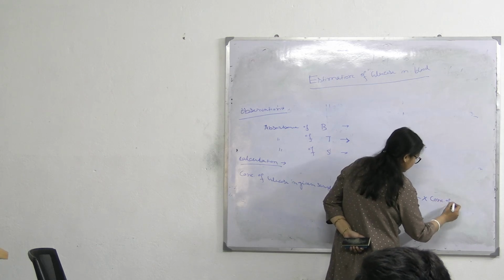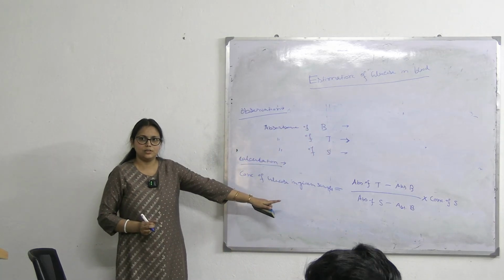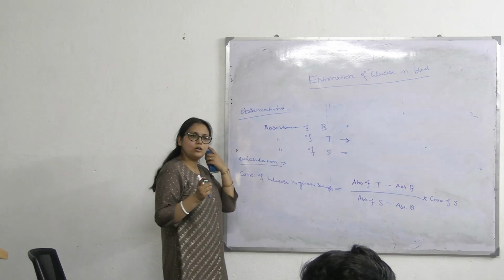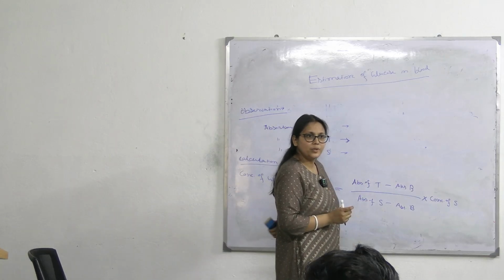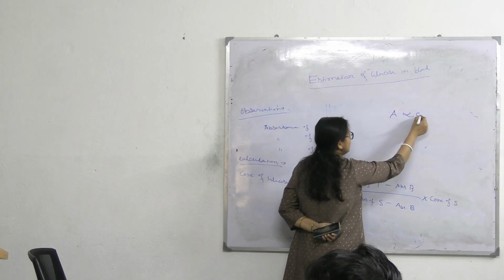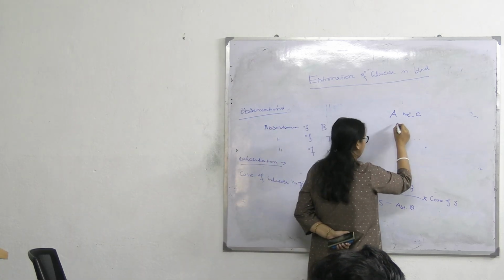into concentration of standard. জানিস তো এটা? হ্যাঁ, জানিস না এটা? এটা না জানলে তো ওই লগ দিয়ে তো তুই এটা করতে পারবি না। According to Beer's law, absorbance is proportional to concentration. A is proportional to C. And Lambert's law, absorbance is proportional to path length.